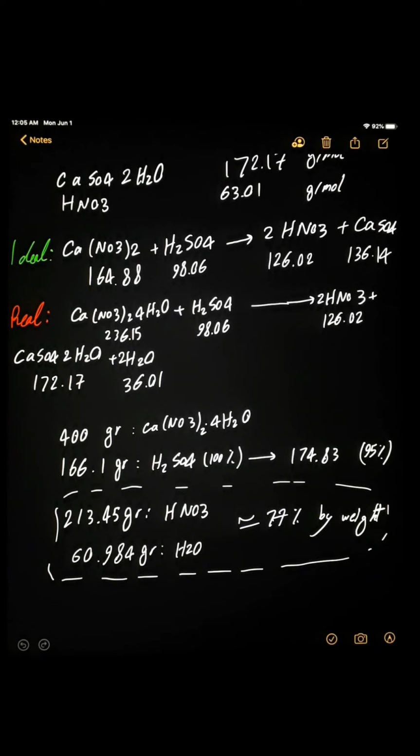It's basically the drain opener sulfuric acid, and I calculated the percentage to be around 95%.